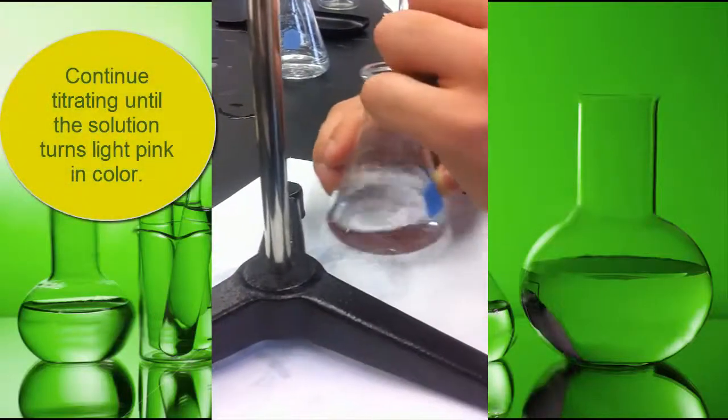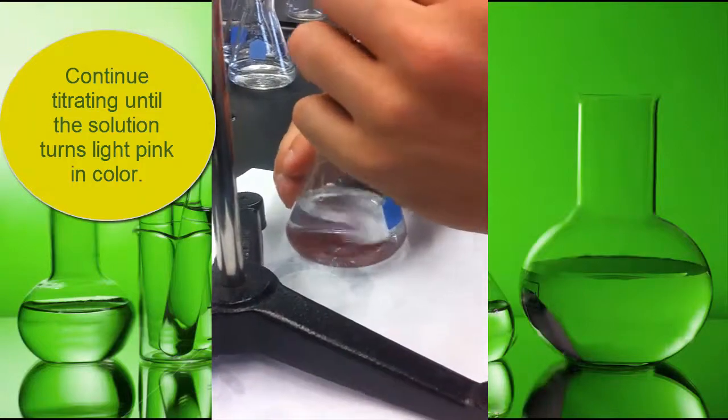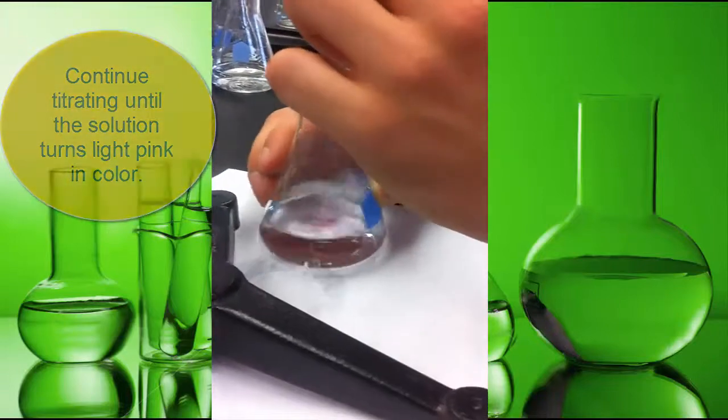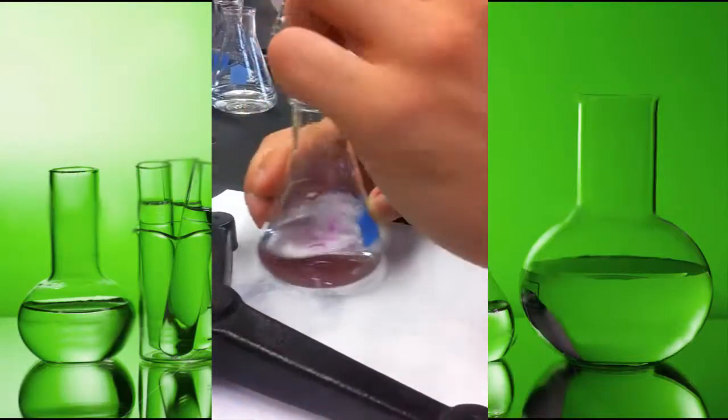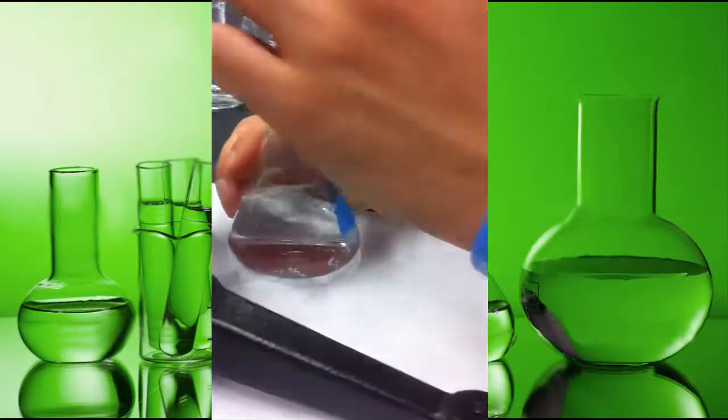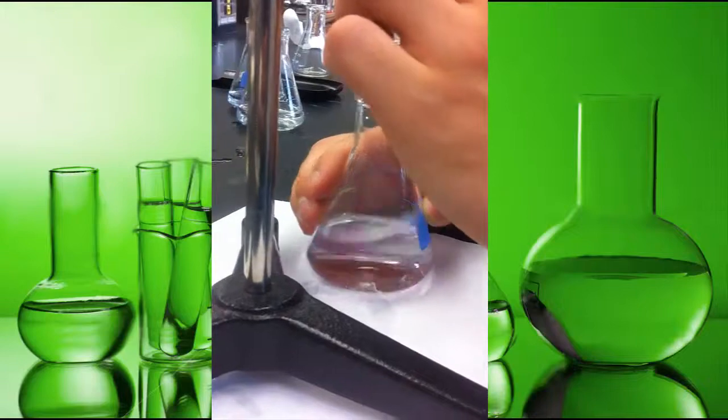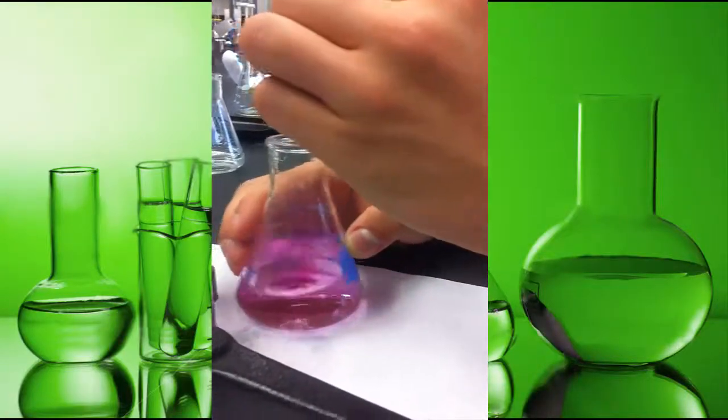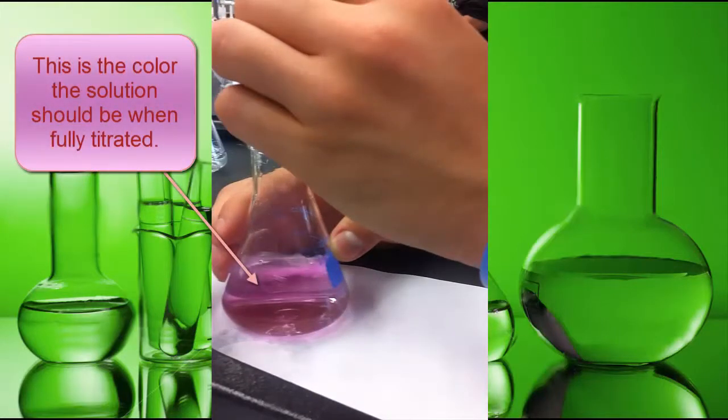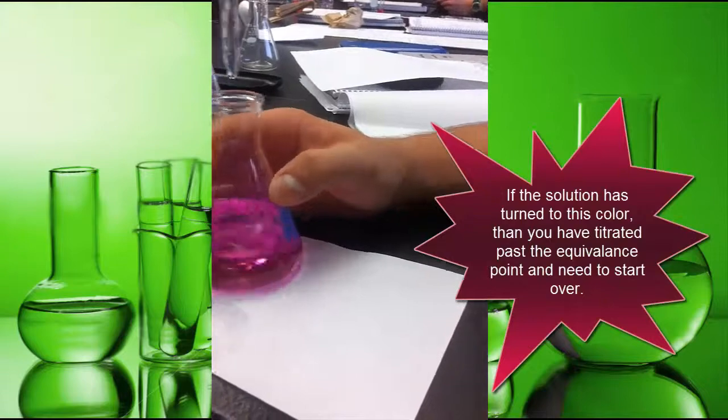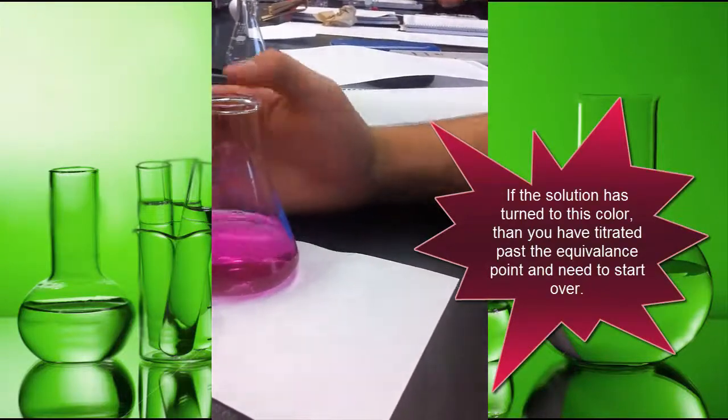Continue titrating until the solution turns a light pink color. This is the color the solution should be when it's fully titrated. If the solution has turned to this color, then you know you have titrated way past the equivalence point and need to start over.